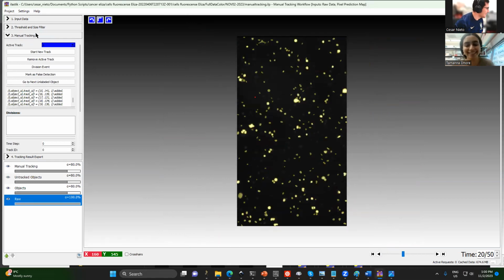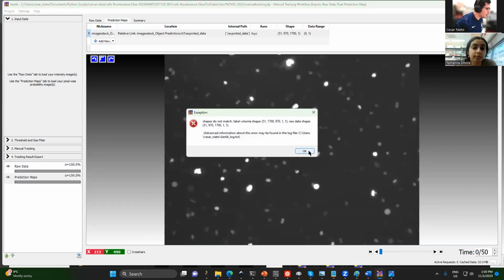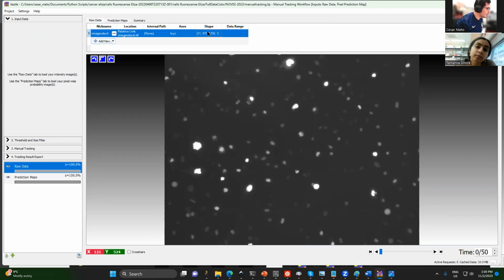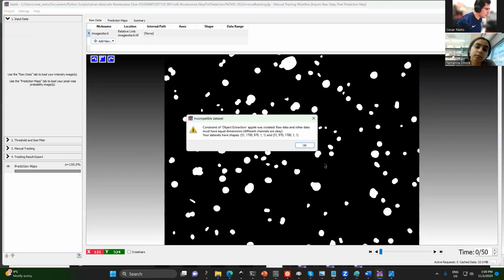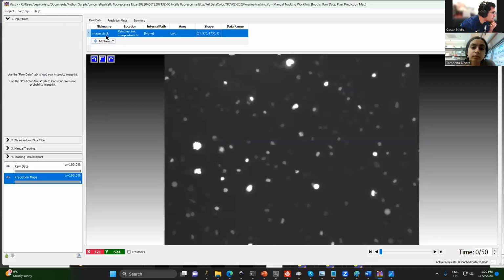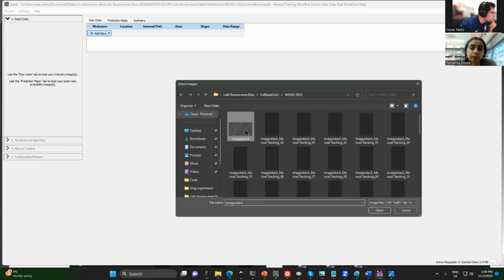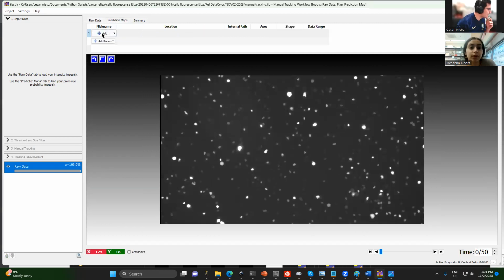Okay, yes. So this was opposite, YX. Yes. Now it's correct. Okay, makes sense.